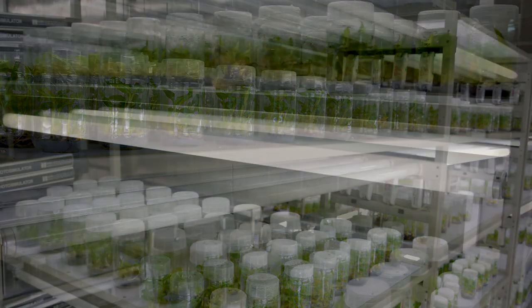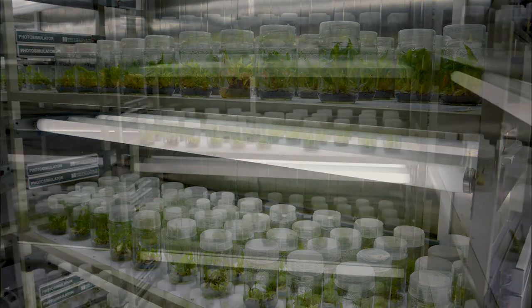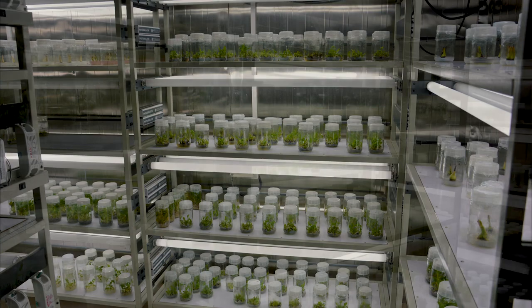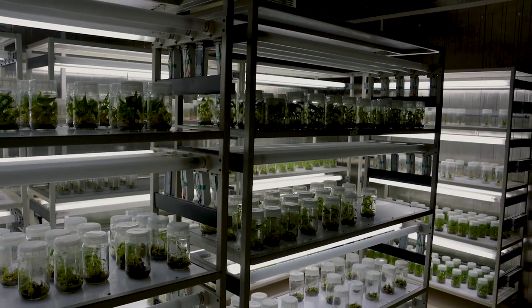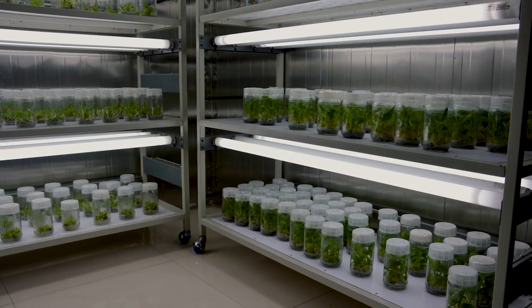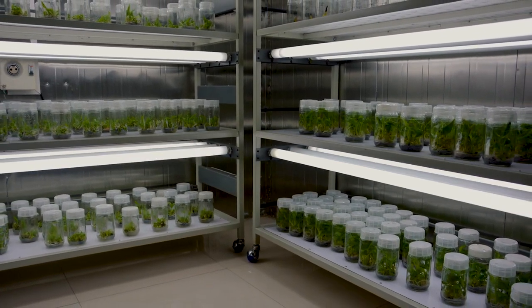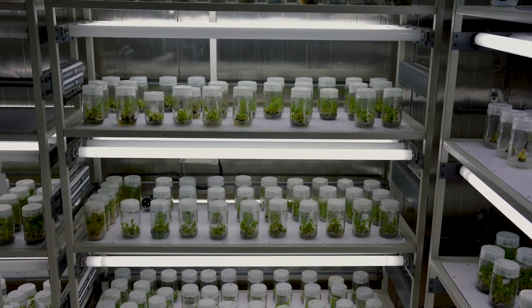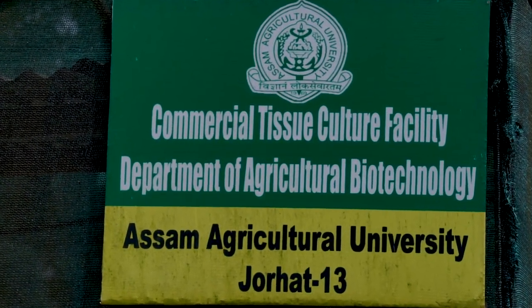For the process of multiplication, after 15 to 20 days of initiation, when the explant turns green, the shoot tips are transferred to the multiplication medium. Subsequently, the newly developed explants are subcultured and transferred to fresh multiplication media 6 to 8 times at every 20 to 30 days interval. This helps in rapid proliferation and multiplication of the shoots.